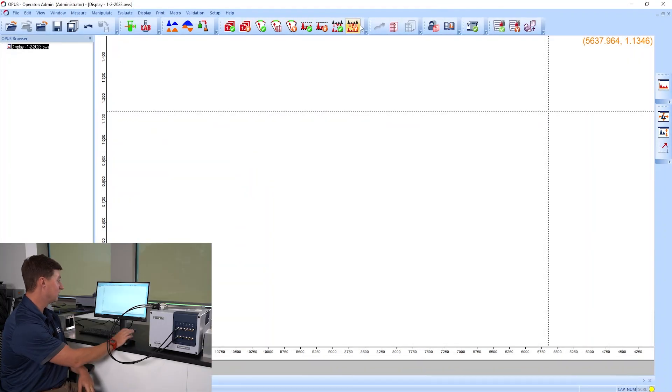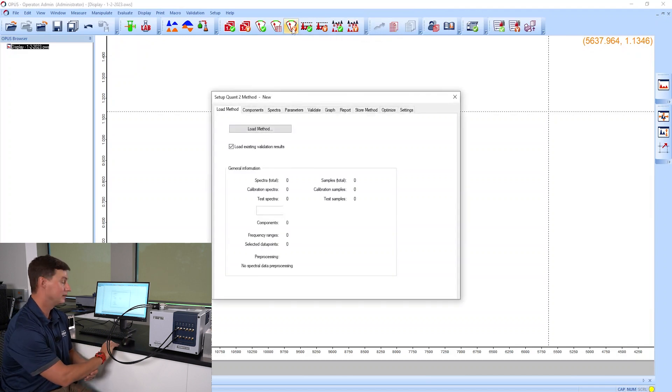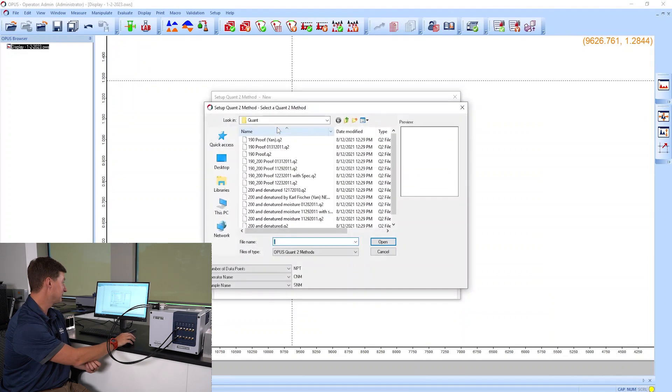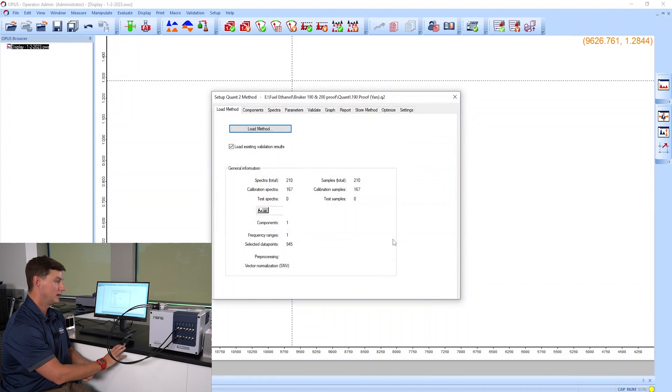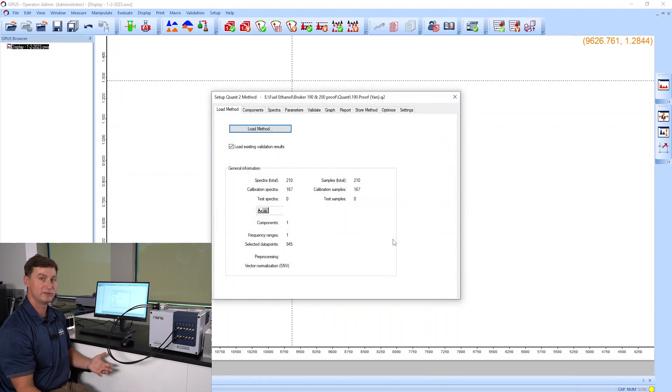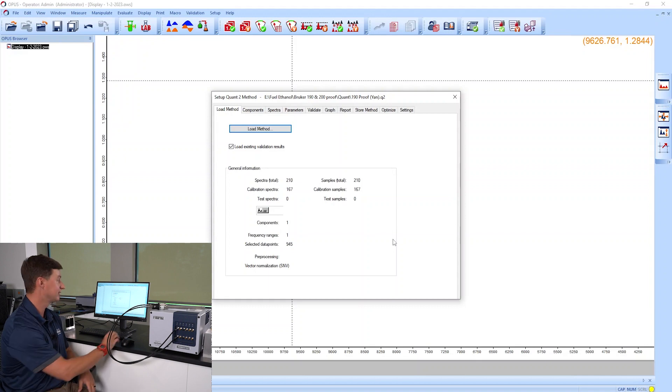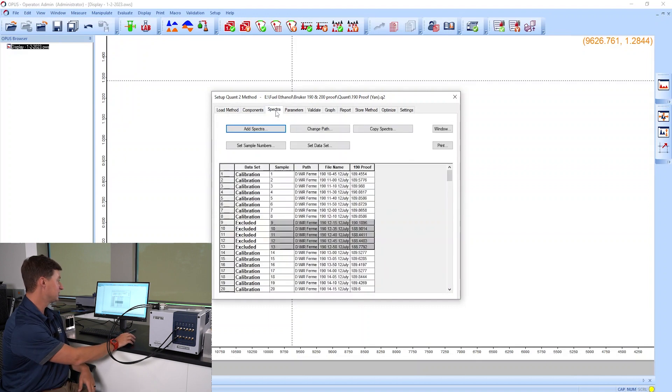I am now in Opus and I'm going to start up our Quant software Quant2. I'm going to load my existing benchtop calibration, which in this case is for apparent proof analysis of 190 proof ethanol, a distillation process. So we have the calibration.